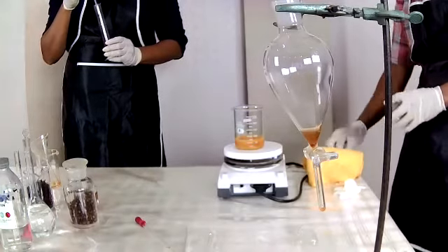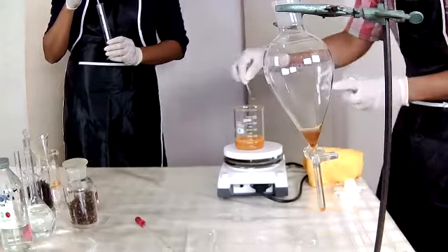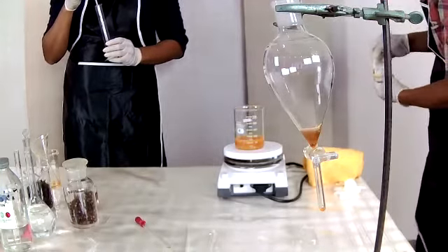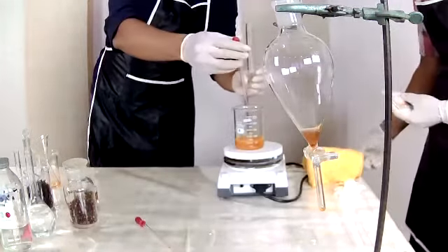And as we are approaching the predicted or expected level, then we can add just a little bit of hydrochloric acid.